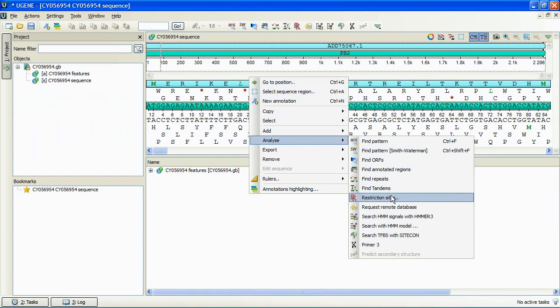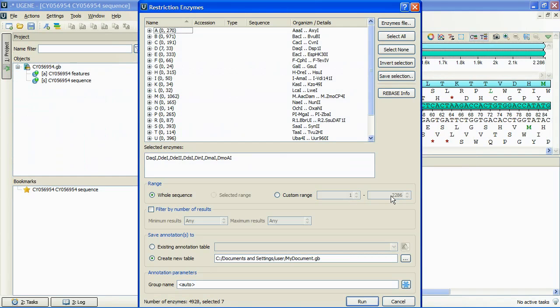Let's consider the available options here. First of all, we can specify the enzymes file pressing the corresponding button.